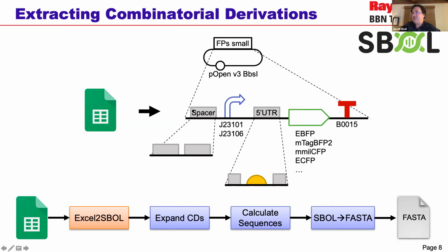And then some of these in turn expand out. So this spacer is made of 2 different chunks put up in front of one another. The 5' UTR is a ribosome entry site flanked on each side by scar sites. And the pieces that I've drawn and outlined, think of them as the variables where we're going to plug in different options for our library. So we've now got a sketch of a library, and in fact, we pull it out of this.